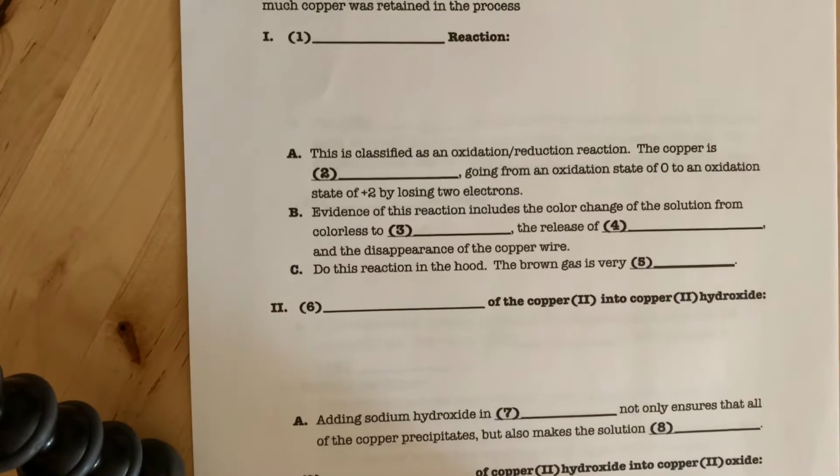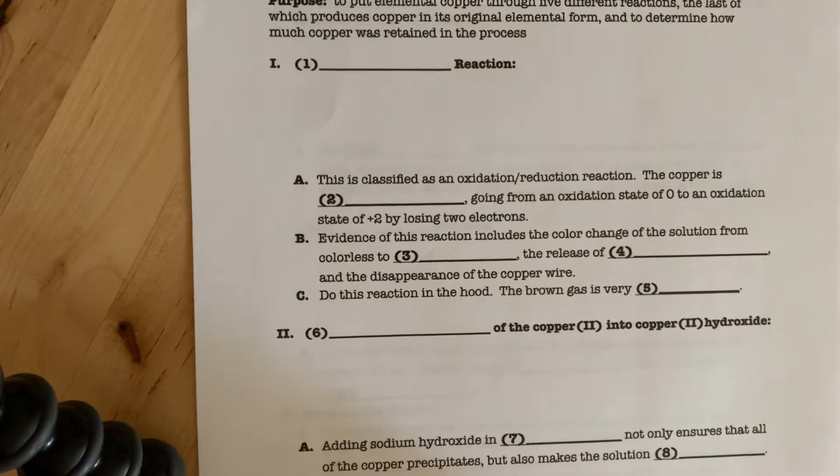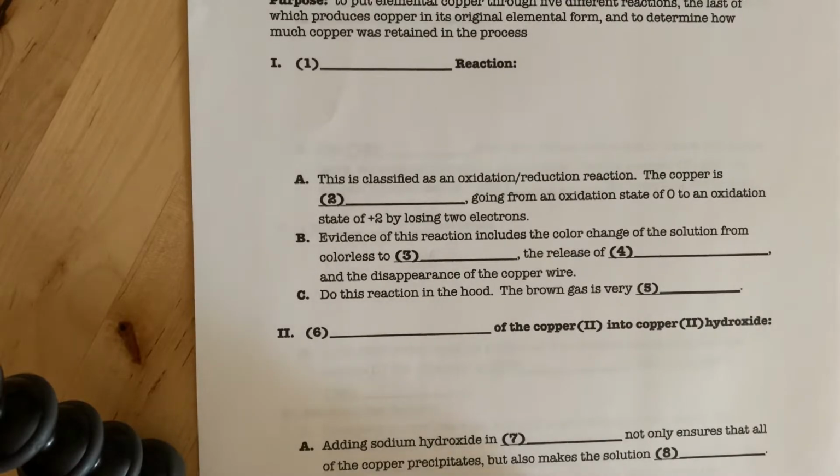Lab 11, the copper cycle. This one's fun. You get to take a piece of elemental copper, just some copper wire, put it through 5 different reactions, and at the end of the 5th reaction, you end up with the copper by itself again, the elemental copper.